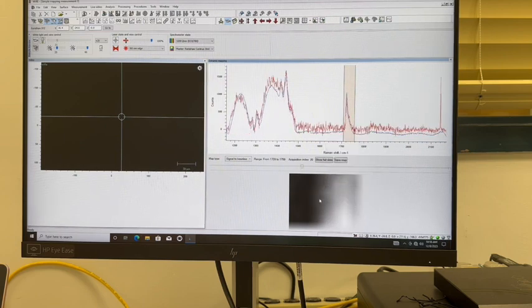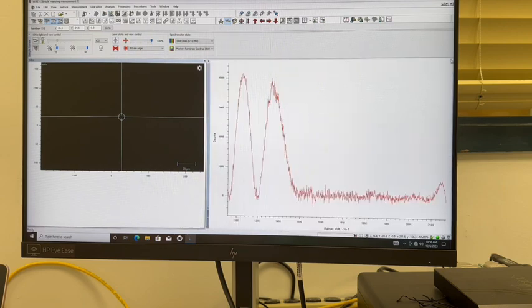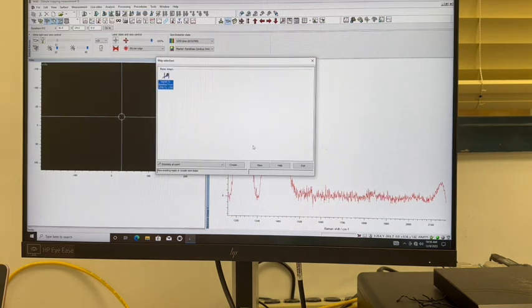Once you have selected the peak you would like to analyze, you can go ahead and save this signal to baseline intensity data by clicking Save Map. You can then close out the screen and open Mapping Review.